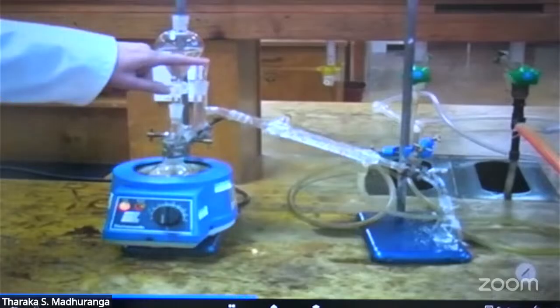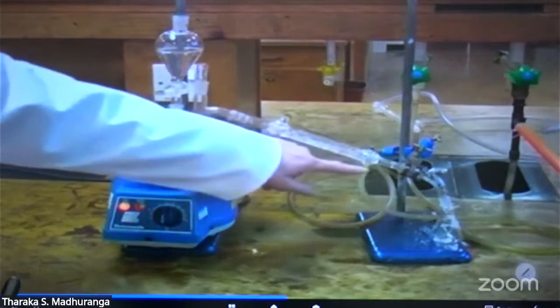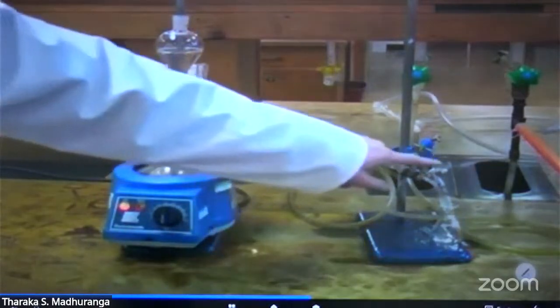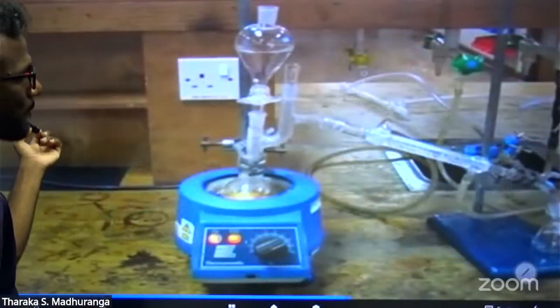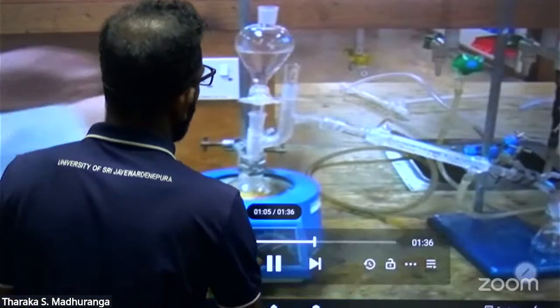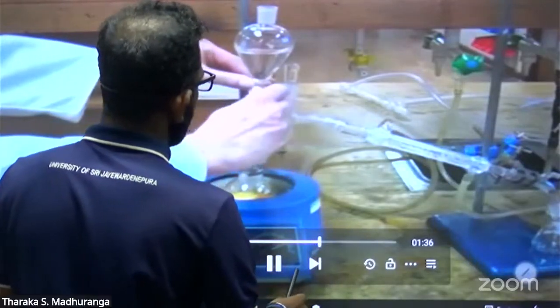In some cases, a splash head may be connected at this point. Here we have a condenser with water running from bottom to top, and after the condenser, we have a receiver running into a conical flask. The water in the flask boils, generating the steam required for the distillation. We can maintain the level of the water throughout the distillation by adding more of it in small portions from the dropping funnel.